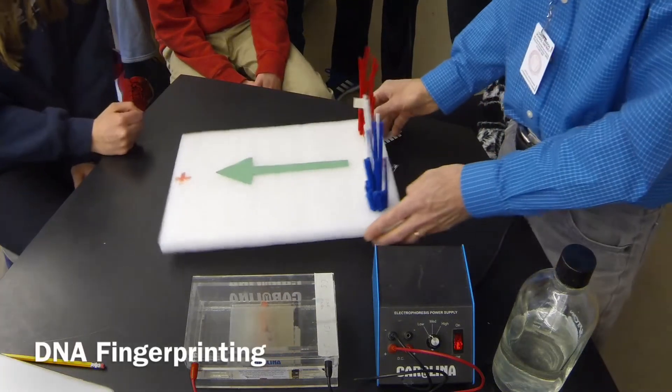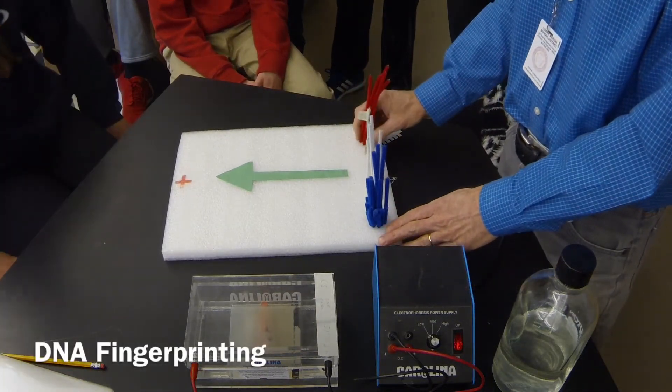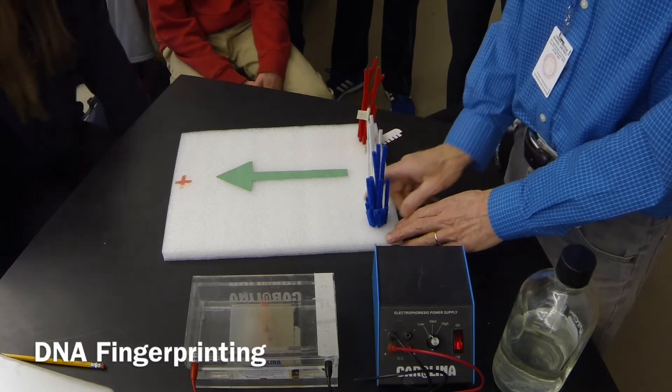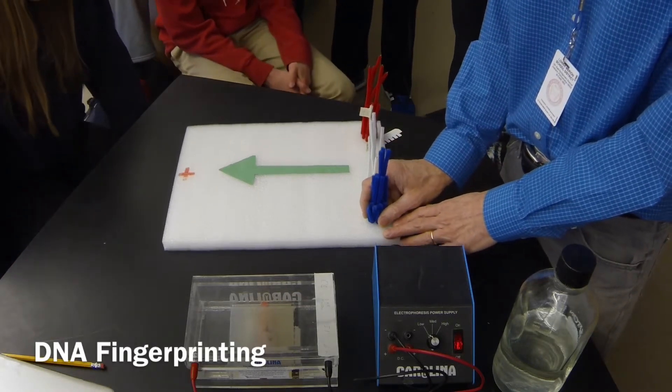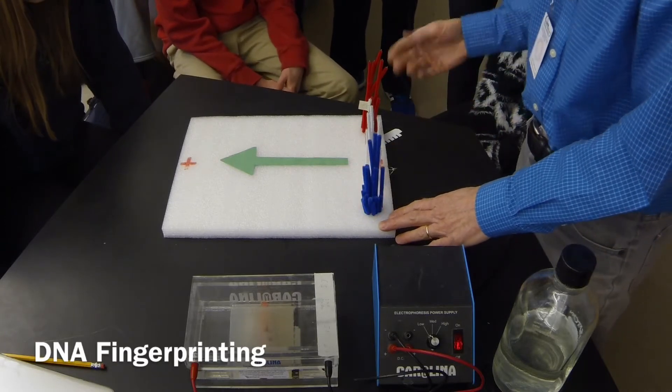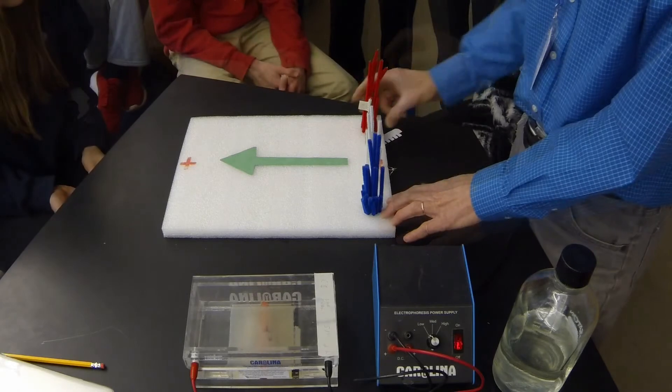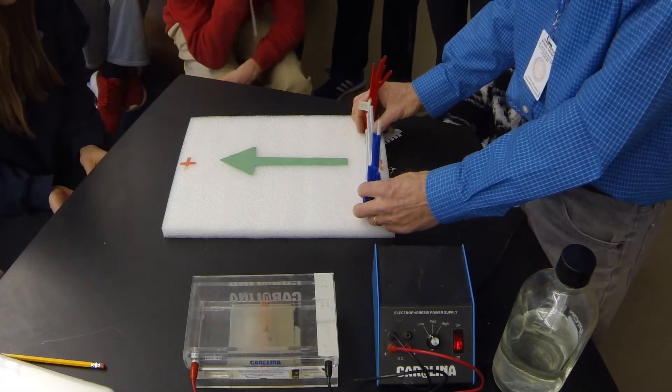Here's a gel. This represents a DNA sample from Emma, and this is the DNA sample from the laptop here. I've used restriction enzyme to cut the DNA into fragments. So I got her sample, I got the sample from the laptop.